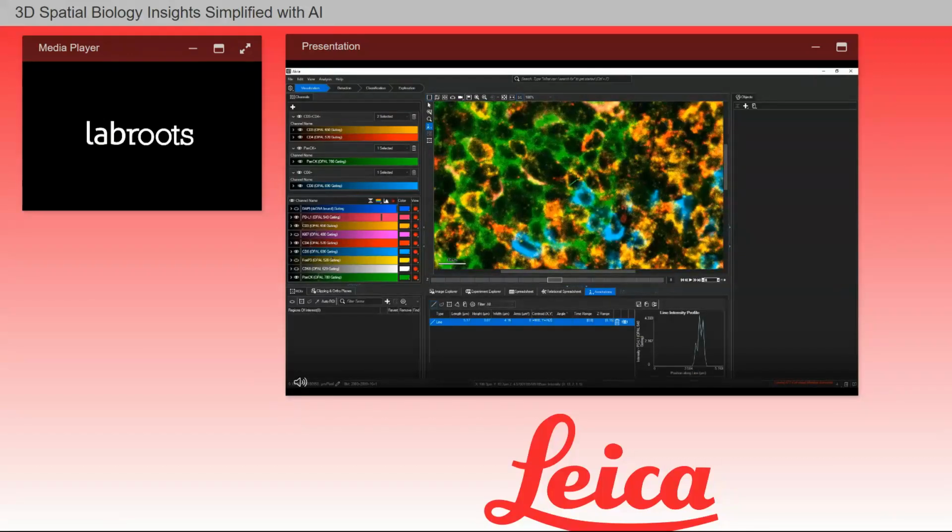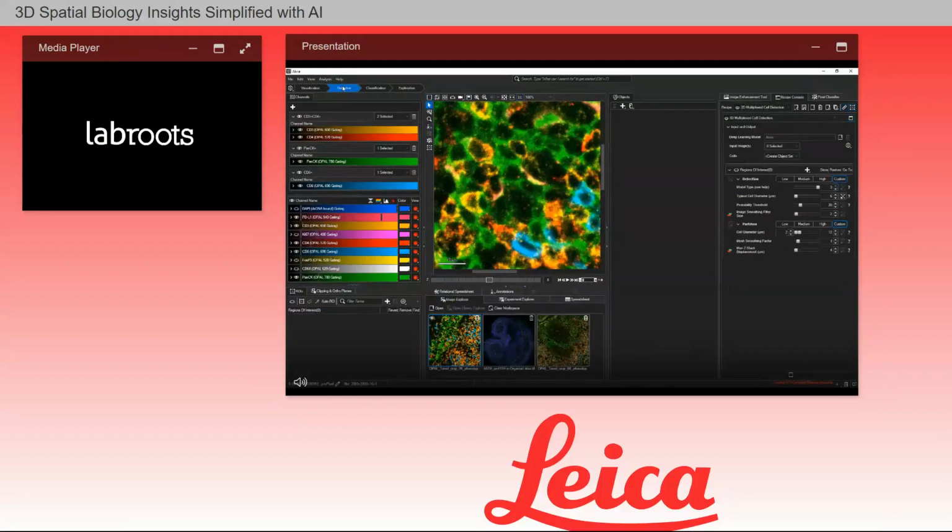Now, let us go to the detection tab. The detection tab has a new layout that includes a section for object display and a panel with image enhancement, recipe console, and pixel classifier on the right. In the recipe console, we will go ahead and select the 3D multiplex cell detection recipe, which we are introducing in Aivia 14. This is a Cellpose-based cell segmentation recipe that allows you to use multiple channels as input.